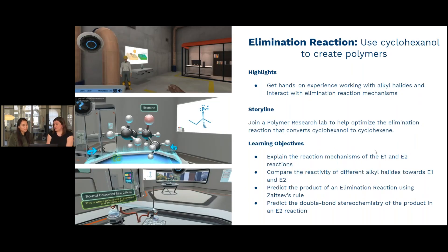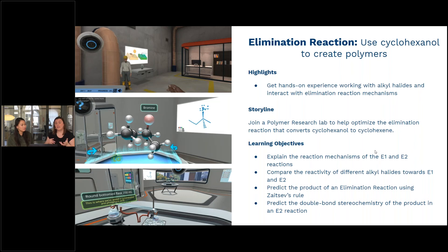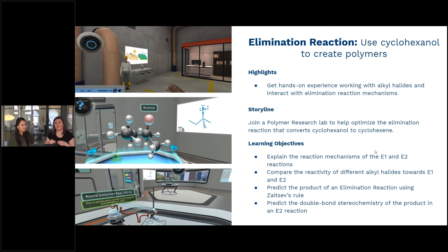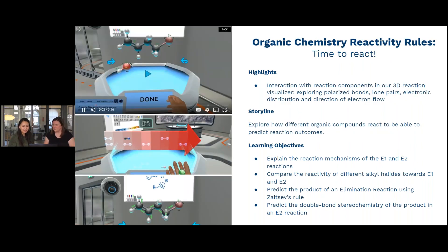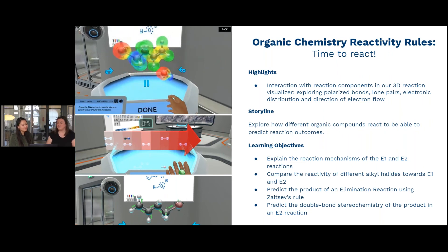In the Elimination Reactions simulation, students arrive at a polymer research lab where there's a problem — a byproduct has appeared in one of their processes. The reaction converting cyclohexanol to cyclohexene has an unexpected byproduct, so students are sent off to the lab to learn the theory, including the differences between E1 and E2 mechanisms, comparing the different reactivity of alkyl halides, predicting using Zaitsev's rule what the product might be, naming those products, and predicting the stereochemistry around the double bond. At the bottom of the screen you can see a distillation setup which the student explores.